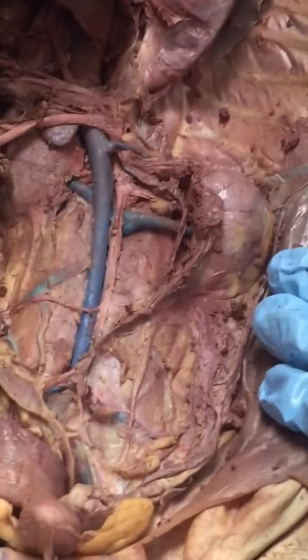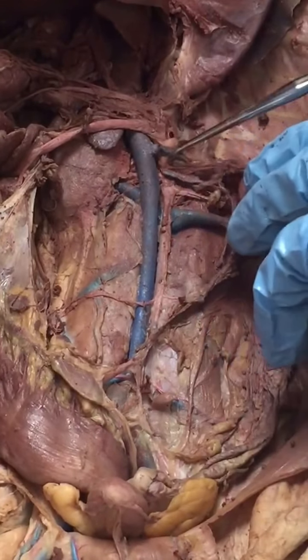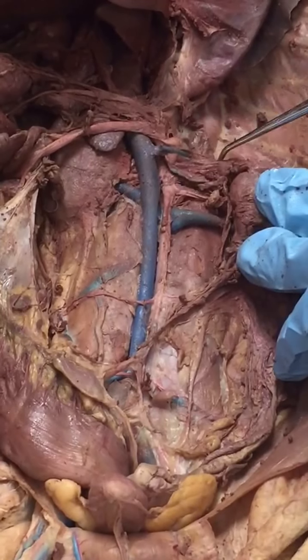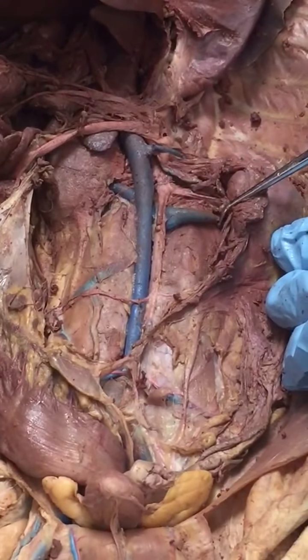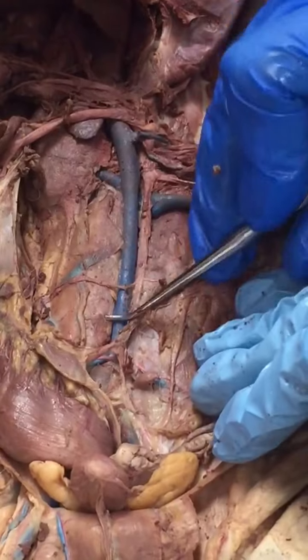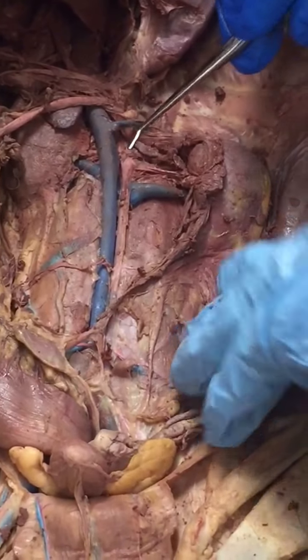To orient yourself, this is the kidney, and this smaller little bean-shaped gland here is the adrenal gland. So you have an artery and vein running underneath the adrenal gland, that's the adrenolumbar artery and vein, going to what's called the hilus of the kidney. Here is the renal artery and vein. Also, I think you guys already know this, but this is our posterior vena cava, the long main vein that runs parallel to the dorsal aorta.